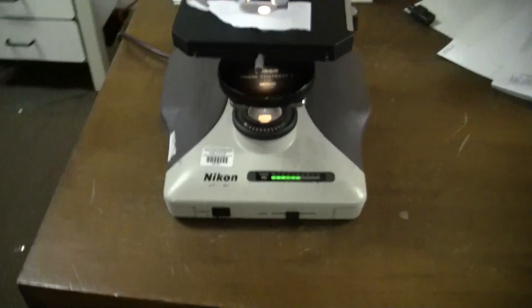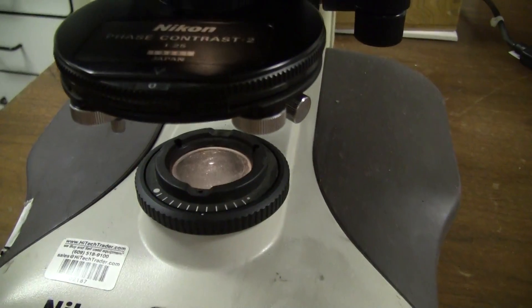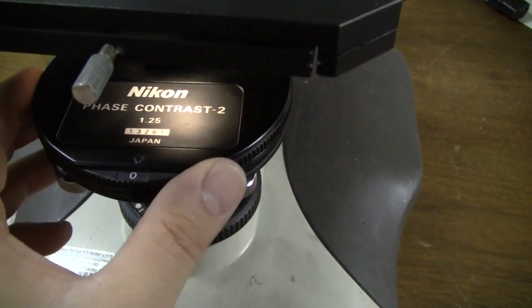This particular microscope has illumination — a variable illumination that powers the lamp. It's got a phase contrast adjustment where you can adjust the phase contrast.